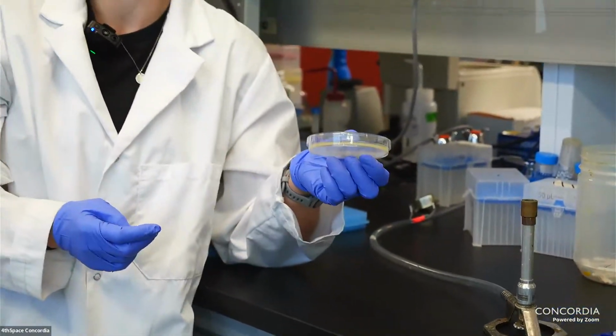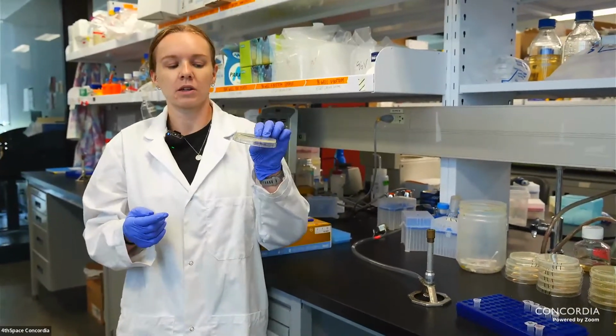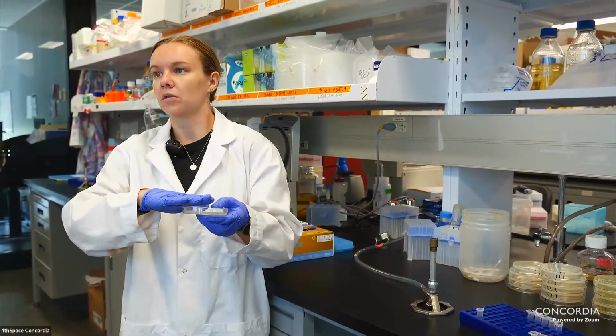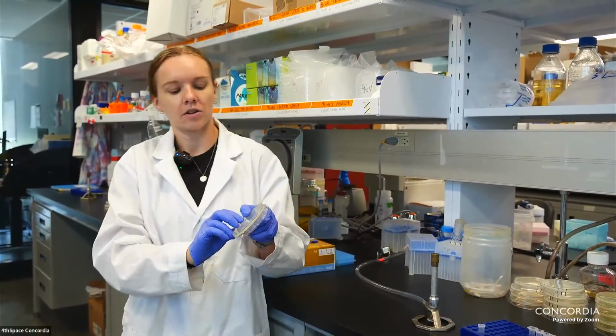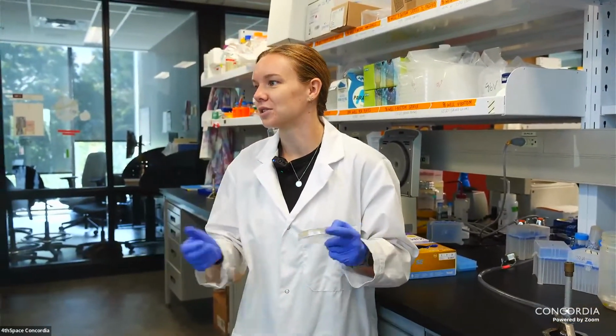And just a side note, when we incubate them, you won't see this part, but you always flip it upside down so that the agar is facing down, because if you were to incubate them like this, condensation could form on the top and that could drip down onto your plate and contaminate it. So always like this once everything's done. And you can actually see the little streaks on it, so you can have an idea of what you did.